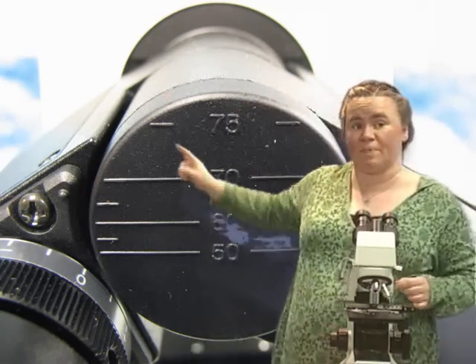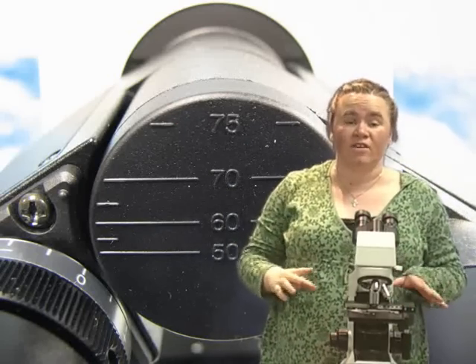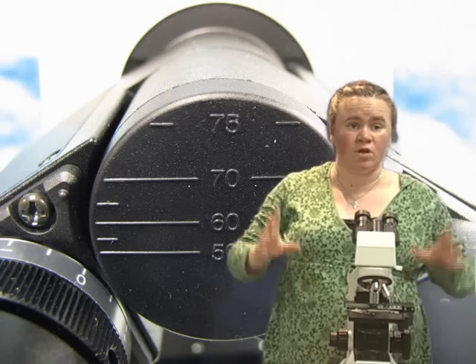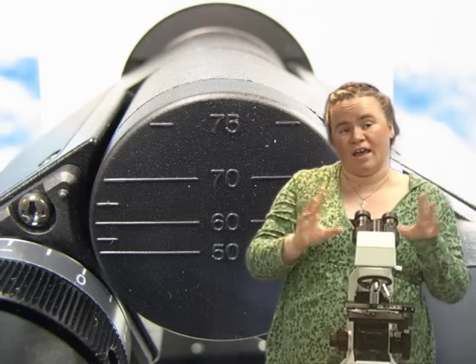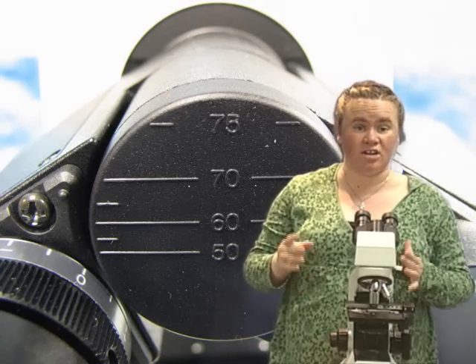You look at where they line up on this circle. Record those two numbers, and then every time you come in and use your microscope, just position those dots in those positions and you're ready to go. Your interpupillary distance is set — you shouldn't have to look in it and adjust it again.